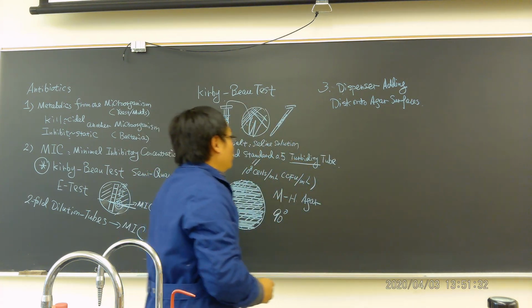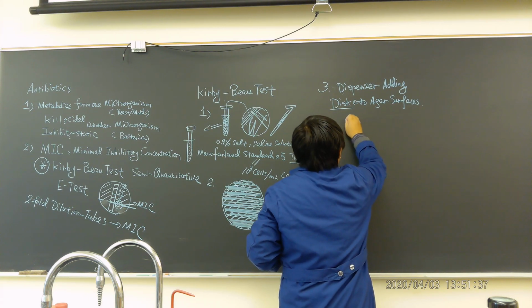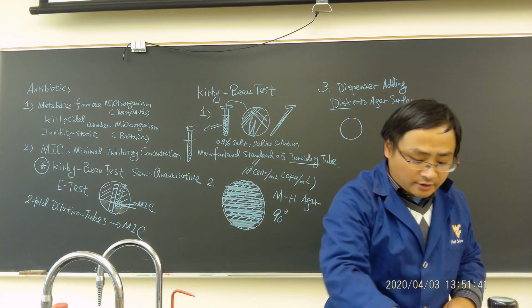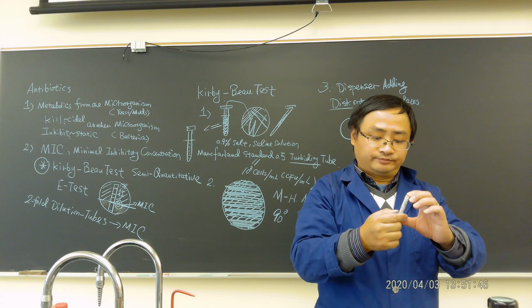Okay. Now, what does the agar surface look like? Well, what does a disc look like? Every disc you will see looks like that. It's very tiny, inside of this type of tube.